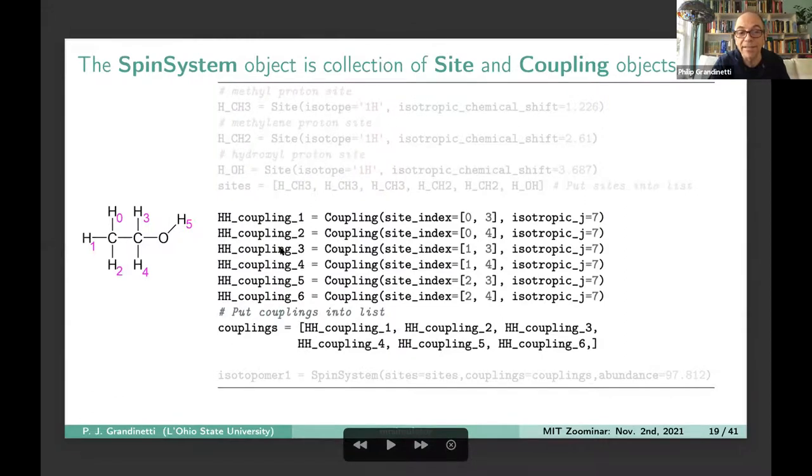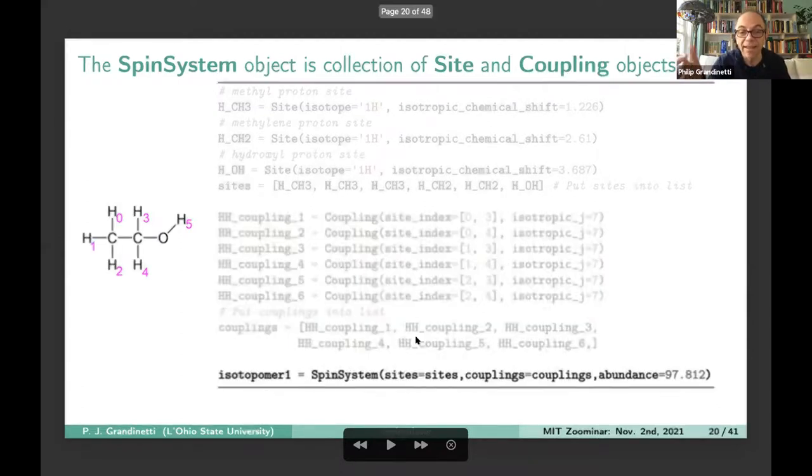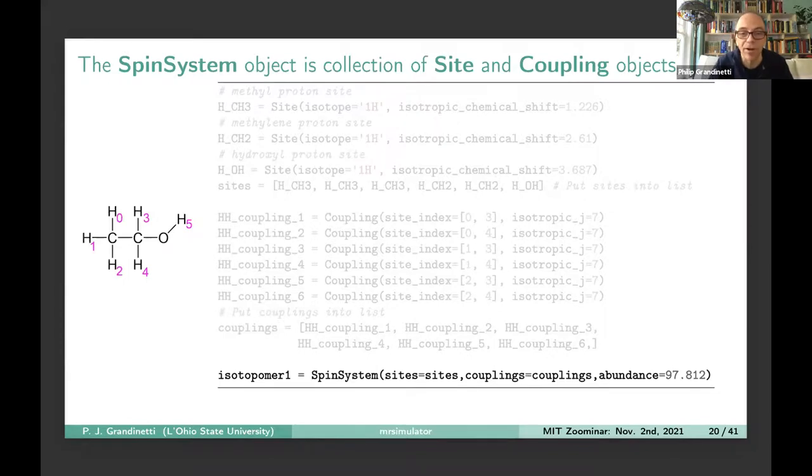Then I create couplings between those. So between 0 and 3, between 0 and 4, I have a J coupling. Between 1 and 3 and 1 and 4, I have J couplings, and so on. I create all of those couplings, put those into a list, and then I create the spin system with the list of sites, the list of couplings. And notice here, I'm putting in an abundance. In this case, if you've done proton NMR on ethanol, you know that there are isotopomers that will be present where some of these carbons might not be C12, but they might be C13. So with C12 here, the abundance of that particular isotopomer is 97.812.